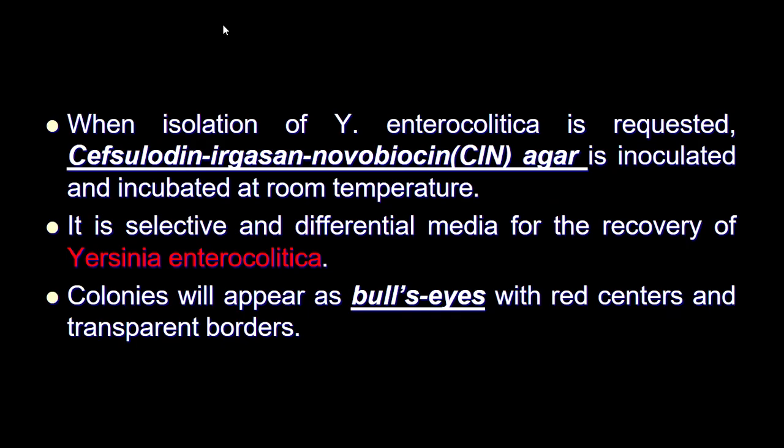So here we said we can use selective media for the isolation of Yersinia enterocolitica, and in the selective media that we are using, we add antibiotics to inhibit the normal flora that's present in the stool.